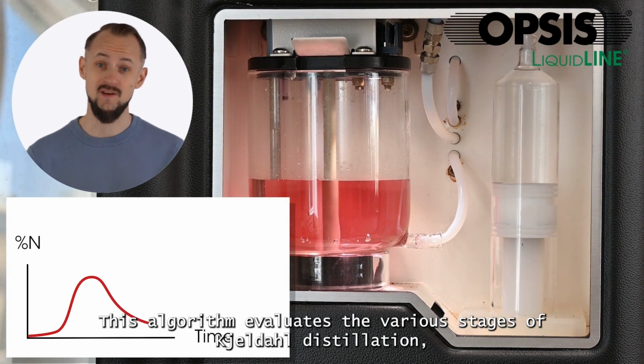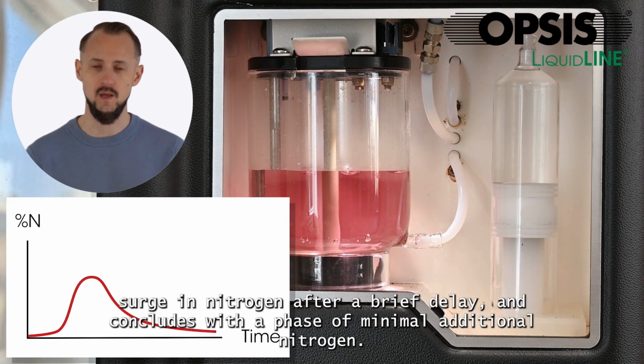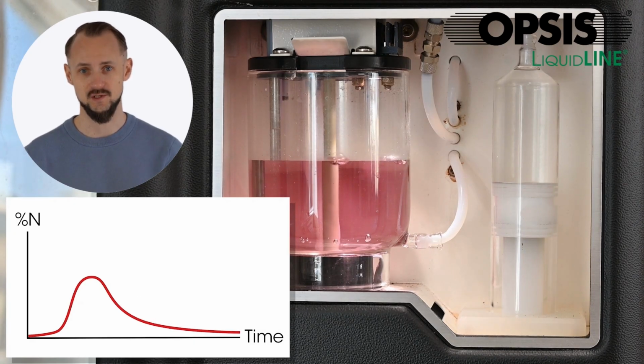This algorithm evaluates the various stages of Kjeldahl distillation, which typically starts with minimal or no nitrogen, followed by a surge in nitrogen after a brief delay, and concludes with a phase of minimal additional nitrogen.